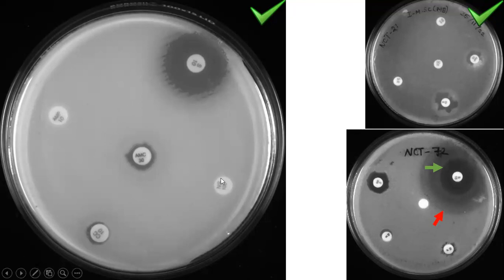So make sure while photographing, the ampicillin, amoxicillin, streptomycin, whatever antibiotic you have used, should be clearly documented. The alphabet should be very clear. Whenever you have an ambiguity of zones like this, better go with a larger zone. Measure it. Usually we measure the zone with a scale from edge to edge, passing through the antibiotic disc. We will be measuring the diameter. You should not have placed your disc so close to the rim. If you have done so, better measure the radius and multiply by 2 to get the diameter.